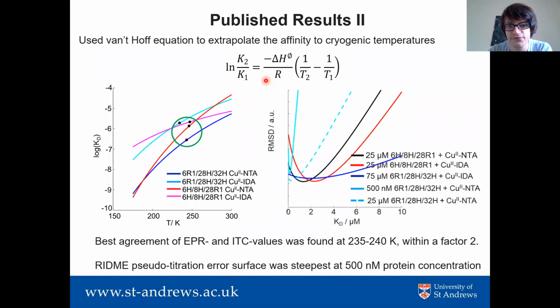And we know from the previous work of the Sechin lab that these spin labels confer very high precision in the distance domain. So we were also quite surprised to note that the copper-copper RIDME had an equivalent concentration sensitivity.